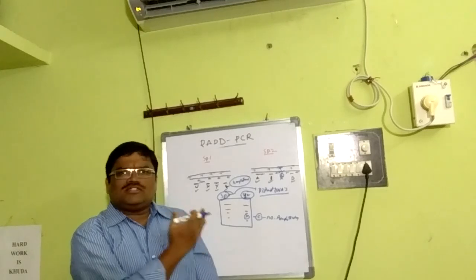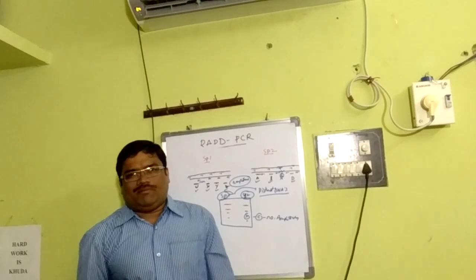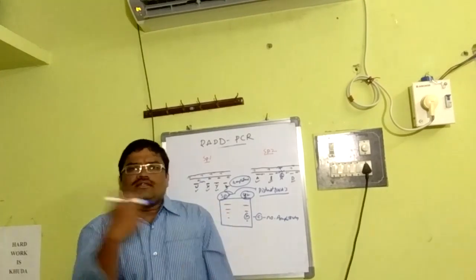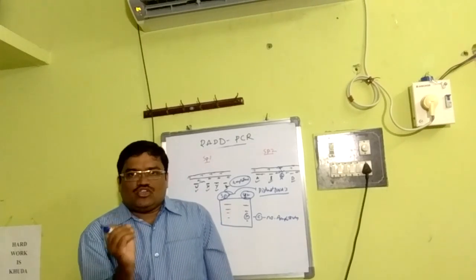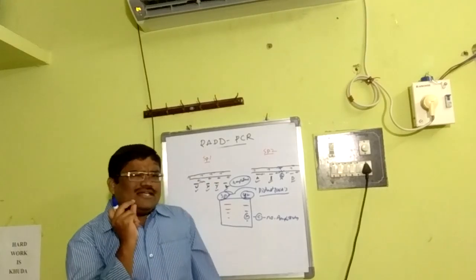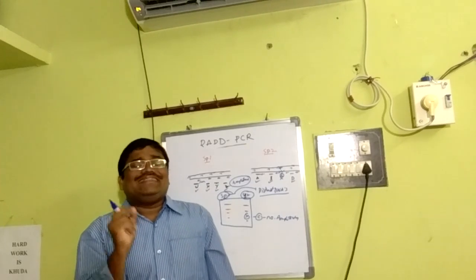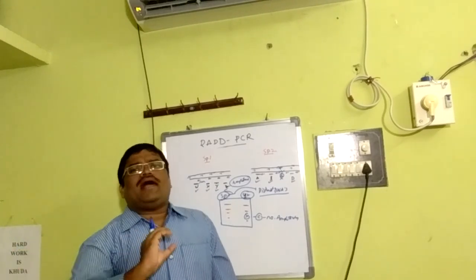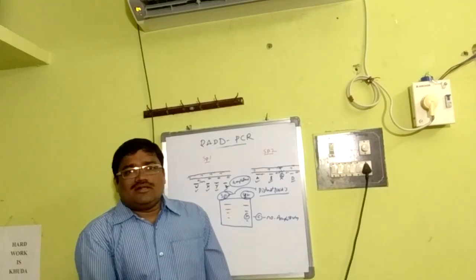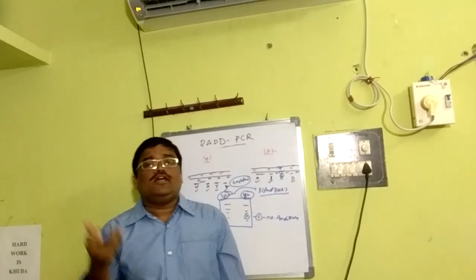How do we establish this? Gel electrophoresis, then autoradiography. The visualization is done by autoradiography. Run the agarose gel electrophoresis, then subject the same to autoradiography for visualization. These are autoradiograms. The entire scenario depends on a single primer that is arbitrary, and it leads to random amplification of DNA segments, which leads to generation of RAPD markers, and with that we can identify genetic variation. This is the bottom line of RAPD.